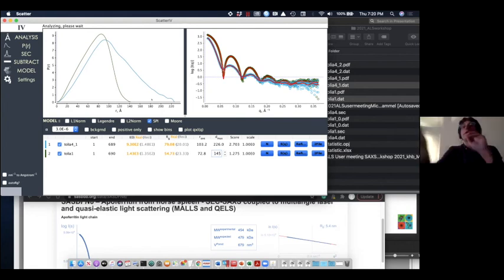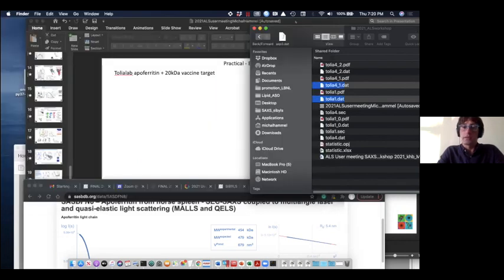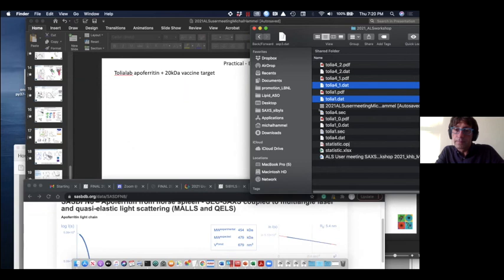If you want to model that, you need to go to more complex stories, but we're going to talk about it tomorrow. So this is very fast, how you look at the data and how you confirm you get a complexation. You can calculate molecular weight from this to confirm that, or look at the other data that you have. I'm going to look at the questions now.